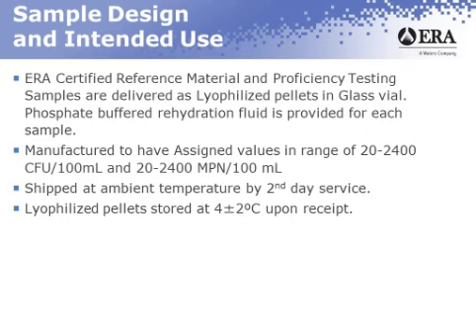Now, once you receive the sample, the pellet does need long-term storage at 4 degrees C. That's just to ensure the integrity of the sample until you get ready to analyze it. As a PT, that may be analyzing it on the 44th day of a 45-day long study, or if it's QC, it might be 6, 8, 9 months after you receive it. You're putting it in the fridge to give it long-term stability.